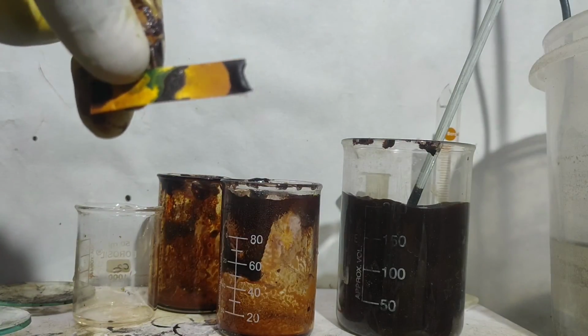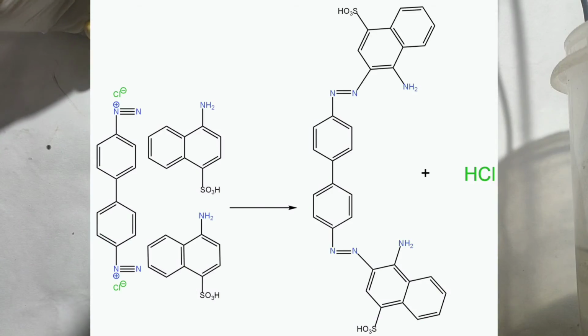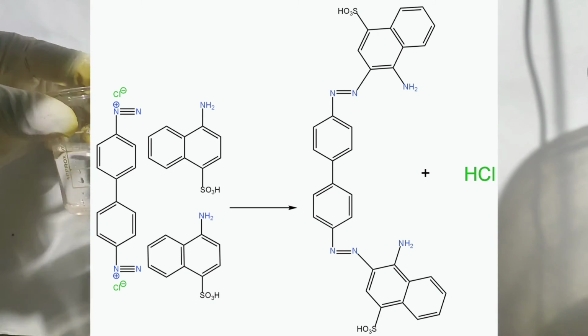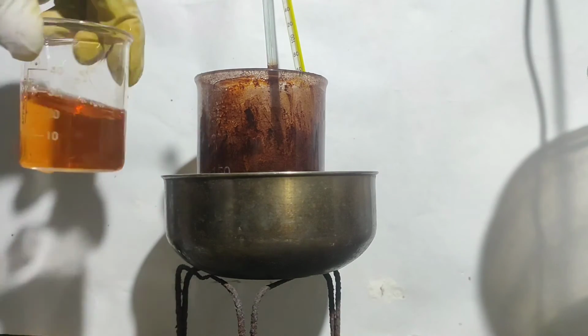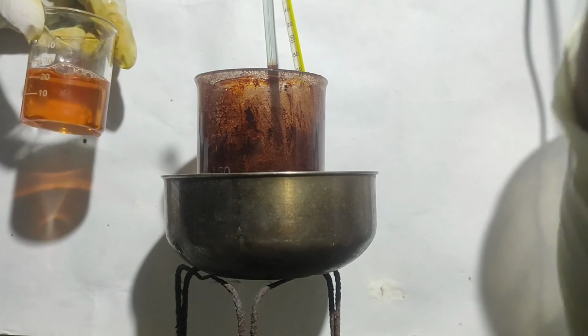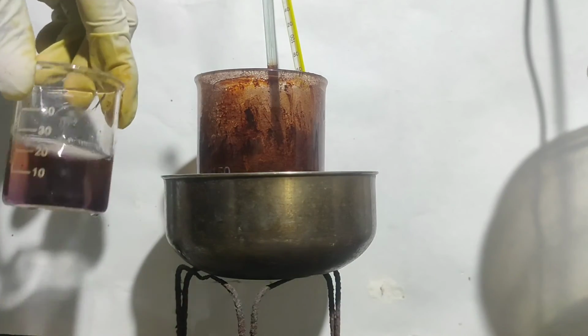This time it was around 9. It was kept at room temperature for 24 hours and then placed on a hot water bath at 60 degrees Celsius for 1 hour. I checked the reaction mixture by taking a small amount of it in dilute sodium hydroxide solution and a red color was formed, which on acidification with sulfuric acid formed a violet color solution.